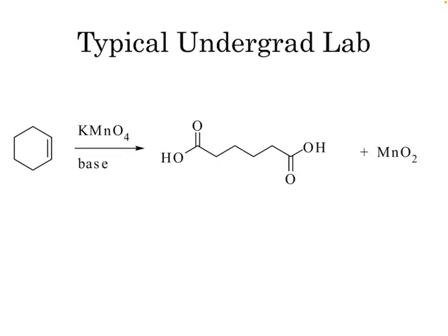Another way that we could perform this lab is by using potassium permanganate, KMnO4, and a base. Potassium permanganate does dye things purple, so it can get a little messy. Additionally, we end up forming a byproduct, manganese dioxide. Again, if we can prevent forming a byproduct, that is better because it's easier to isolate adipic acid.